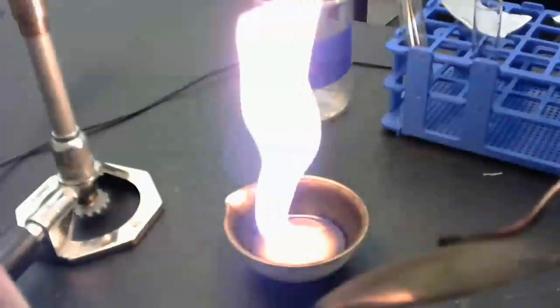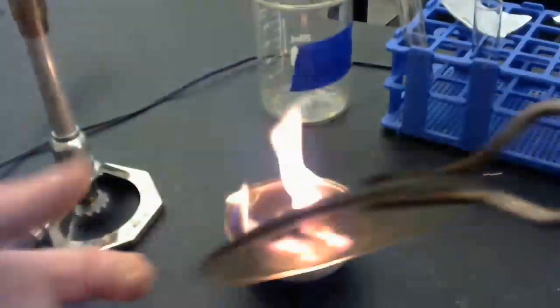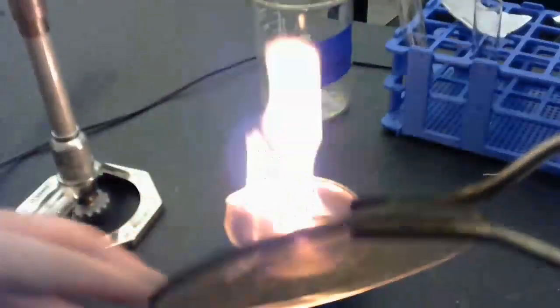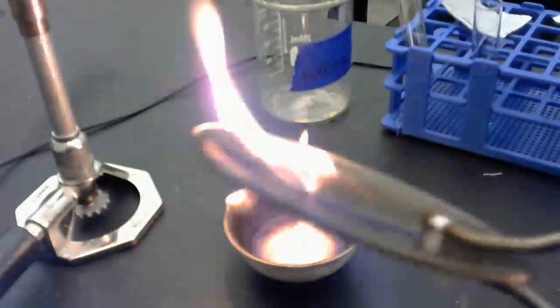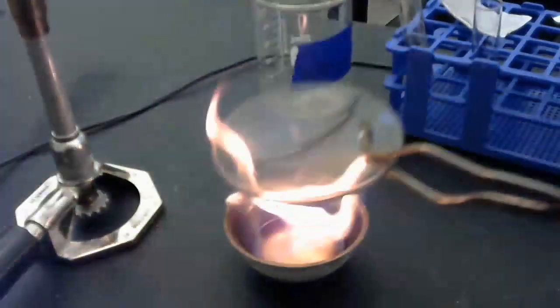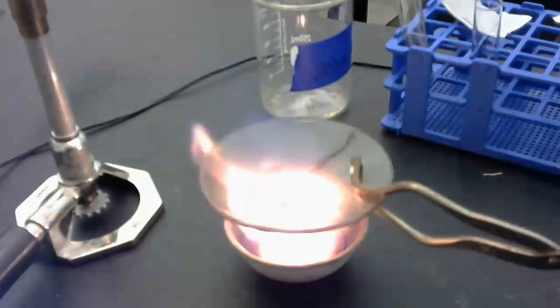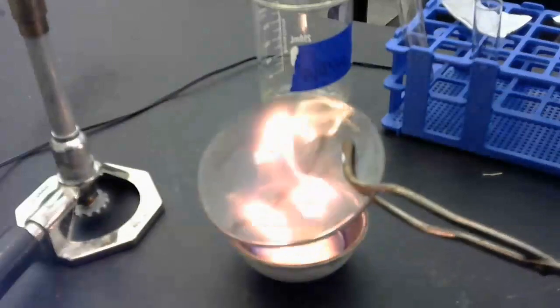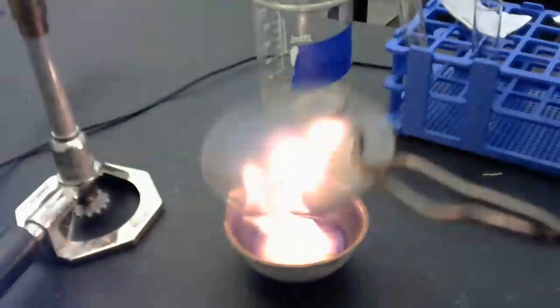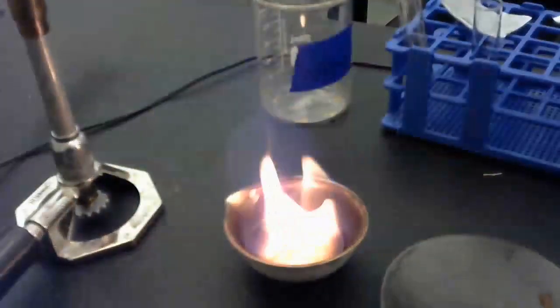Okay. So I could actually take that and wipe it, and I'm going to basically wipe off water, and I have water on my finger. And it's actually dripping onto the table a little bit. So that's the reaction of isopropyl alcohol and oxygen in the air to produce carbon dioxide and water. And the water is what's collecting on the bottom of this watch glass right there.